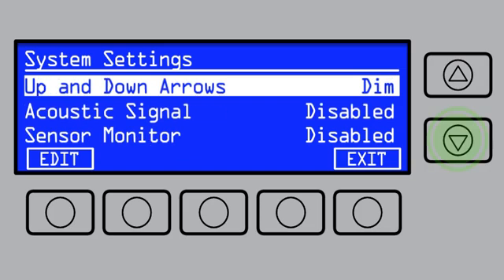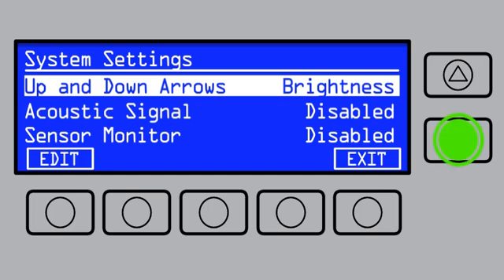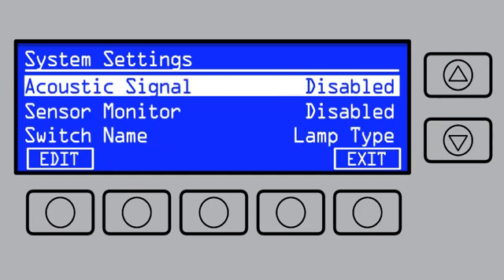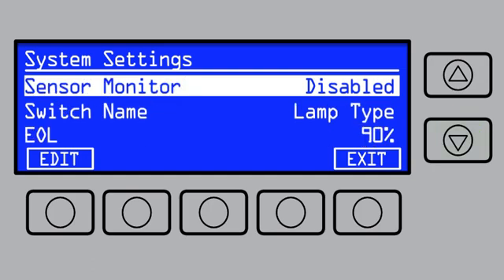The up and down arrows can be customized to change dim control or LCD brightness and contrast. You can enable or disable an acoustic signal when a message appears on screen. When enabled, Sensor Monitor will display the sensor data for things like the lamp, input, and temperature in the main menu.